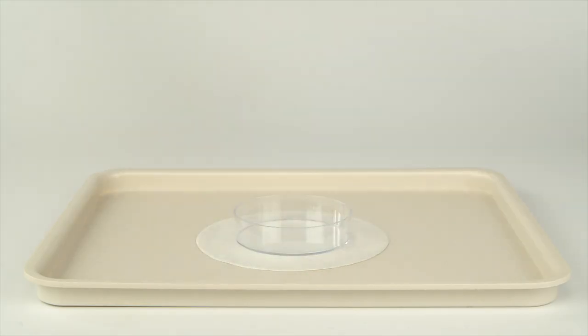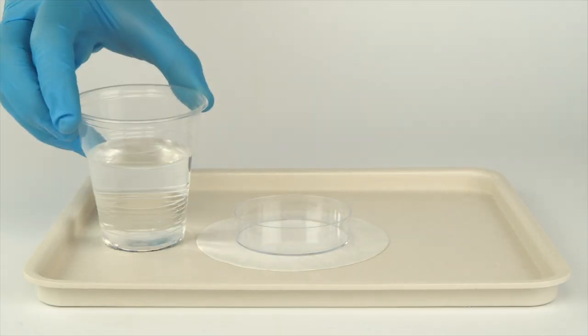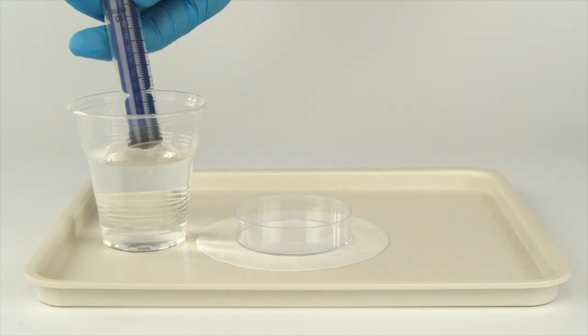Set the small petri dish on the piece of filter paper. Add 10 milliliters of water using the syringe.